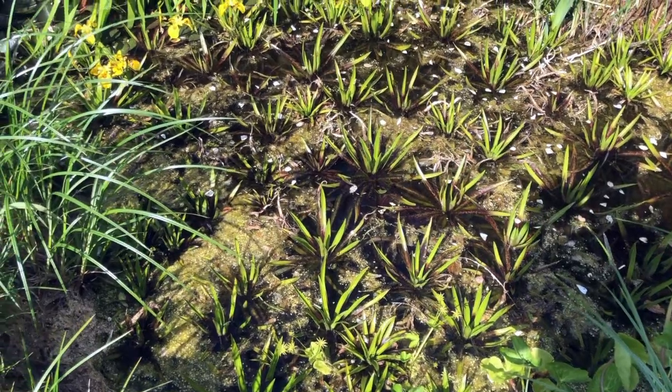Next thing I want to do is get some pond water and have a look at a sample of that to see if we can see any pond life. Now, the best thing to do to look at that is to get some pond water into a little dish. Okay, so here we are now looking at the pond water sample. Now, it takes a bit of patience because you've got to go around, but you can often see things moving and swimming. So here are some odd things swimming around there.